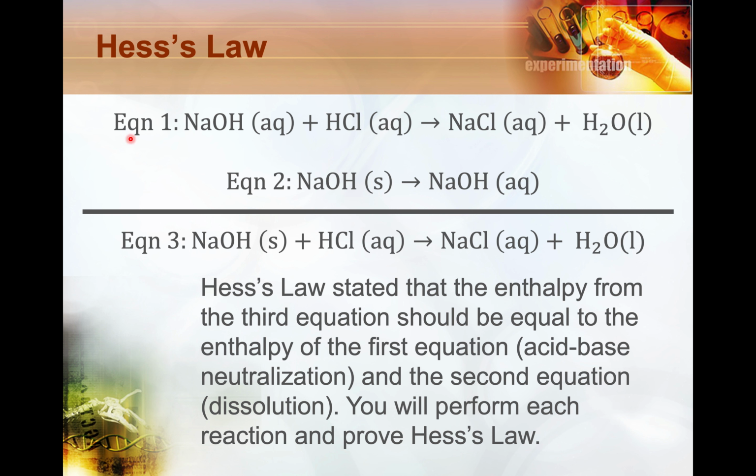But the idea in the lab is that you'll be finding the enthalpy of the neutralization of sodium hydroxide and hydrochloric acid. You'll then consider the enthalpy of the dissolution of sodium hydroxide, and then you'll consider the enthalpy of the combined reaction. And again, this enthalpy should be equal to the enthalpies of the first two combined.